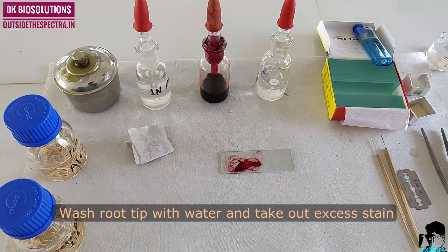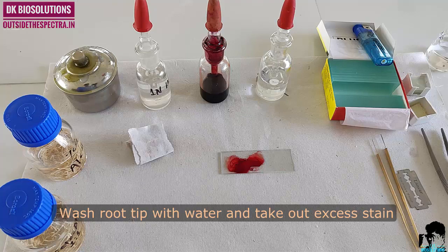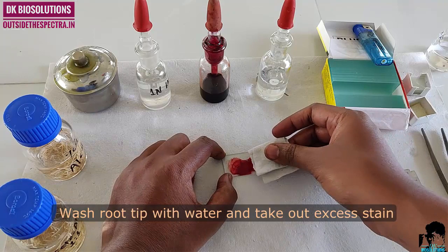To take out excess stain, wash the root tip with water and blot it with the help of blotting paper.